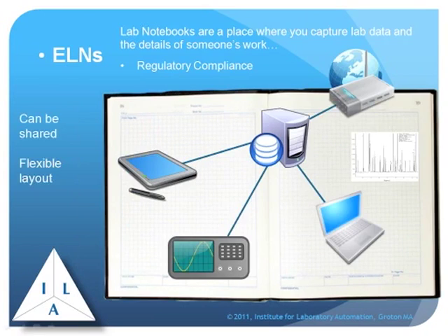Lab notebooks are places where you can capture data. They can help you provide regulatory compliance because it's easier to search and find information. You have a number of different types of inputs that are possible. There are some symposiums that are talking very much about the use of tablet input, not just for test data, but for animal experiments. For example, if they're going out and working with a bunch of animals, they can get the data from the animal, log it in through the tablet, and also photograph the animal so they can get a good idea of its ID and what its condition is.